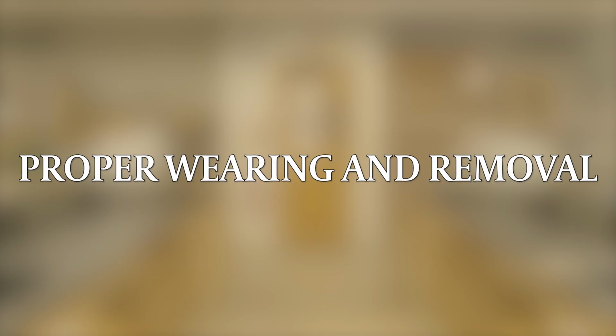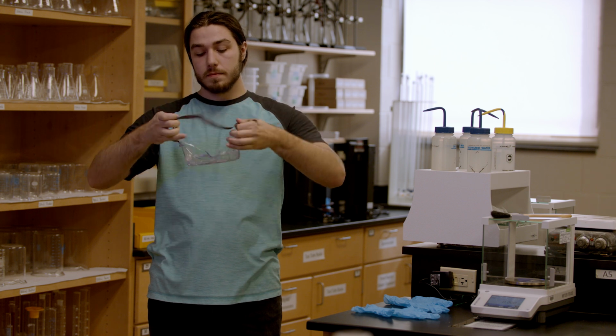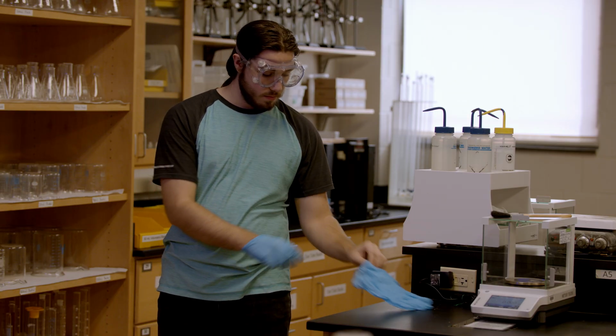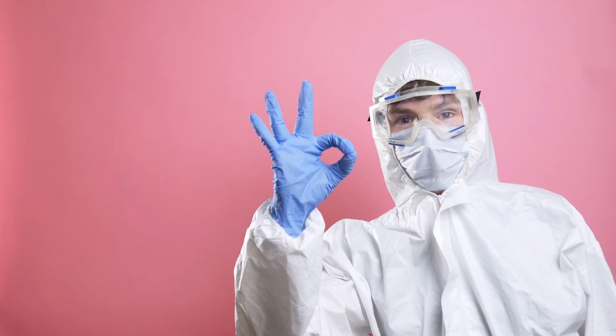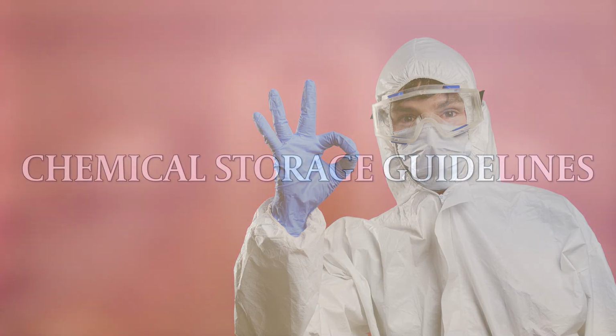Wearing PPE correctly is just as important as choosing the right equipment. Ensure your gear fits snugly and comfortably. And remember, proper removal is essential to prevent contamination. Regularly inspect and maintain your PPE. Clean and sanitize it as needed, and replace damaged or worn-out gear promptly. Your safety depends on the integrity of your equipment.